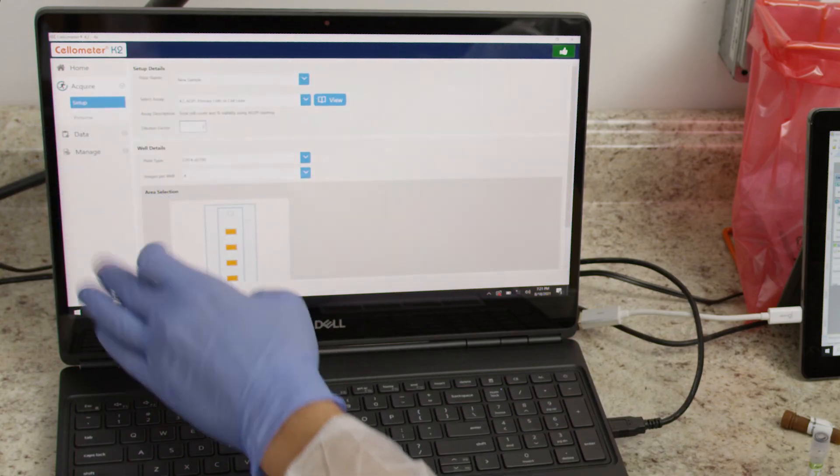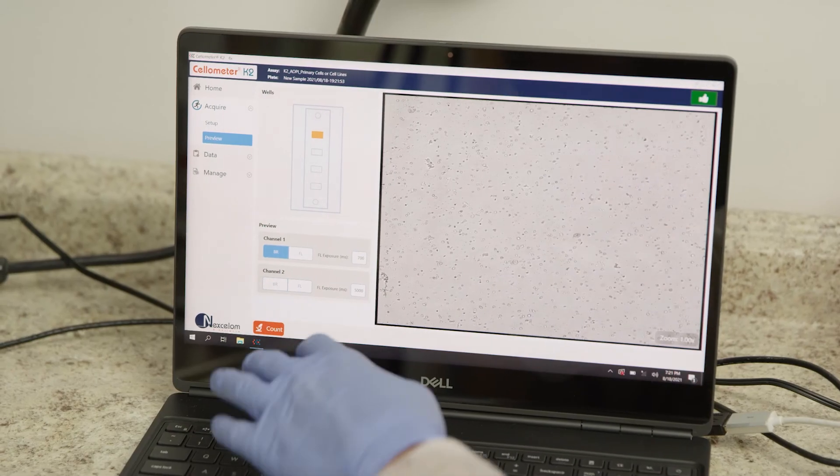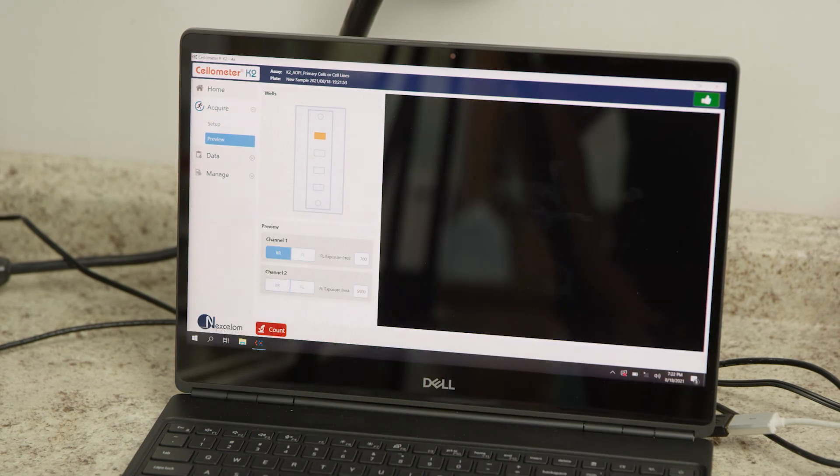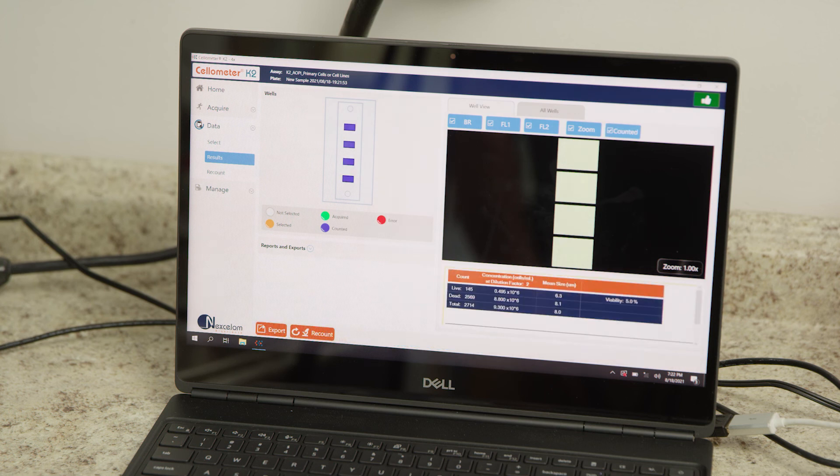Adjust the analysis parameters to count objects greater than 4 microns. You may also need to adjust the relative gain of different fluorescence channels on a fluorescence counter to avoid artificially high viable cell counts from fluorescence signal bleed between channels. This completes the process for using the Singulator.